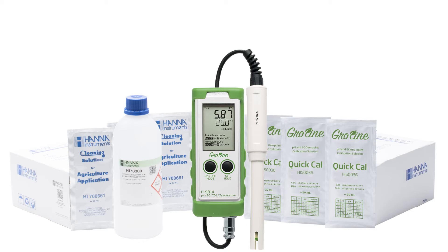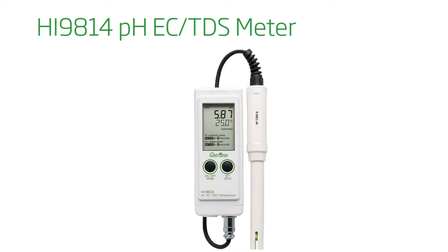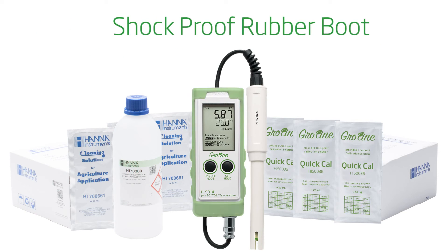The HI9814K Growline kit is an all-in-one kit to get you up and running right out of the box. The HI9814K includes the HI9814 pH/EC/TDS meter, pH/EC calibration sachets, agricultural cleaning solution, storage solution, and a shockproof rubber boot.